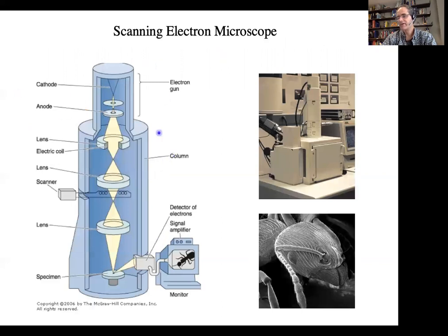Here's a cartoon picture of the electron microscope like the one that we're using. In our electron microscope, there's a cathode, and electrons are emitted from the cathode. It's actually a hot filament. They're accelerated across a voltage. We may be using a voltage of 15,000 volts, for example. This shows the electromagnetic lenses, and the beam is focused onto the specimen or sample. An additional magnetic component is used to steer the beam around on the sample.